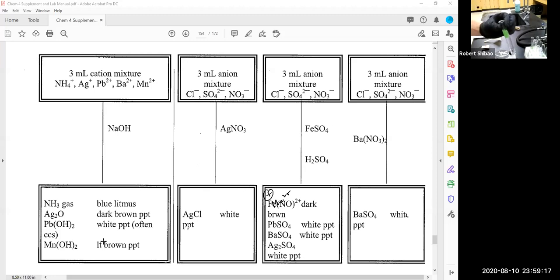Okay, so I have my silver nitrate in the pipette, and then I'm going to slowly add it drop by drop, and let's watch what happens to see if we get any precipitate. So here goes. So I added about a mil. I had about a mil of unknown, and I added a mil of silver nitrate. Now silver nitrate, I don't want to spill this on my fingers, obviously, because it stains them black, but I have these gloves on anyway.